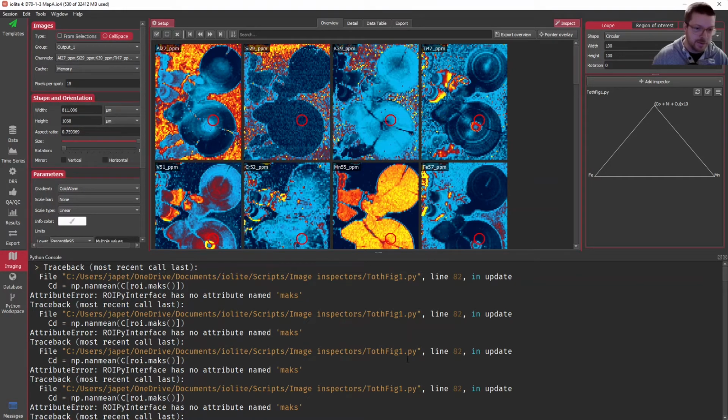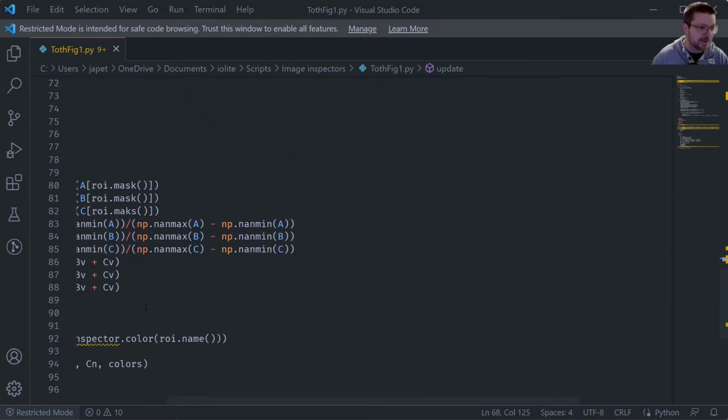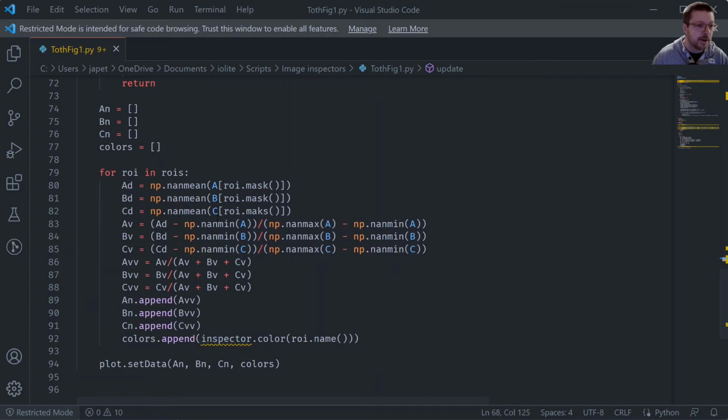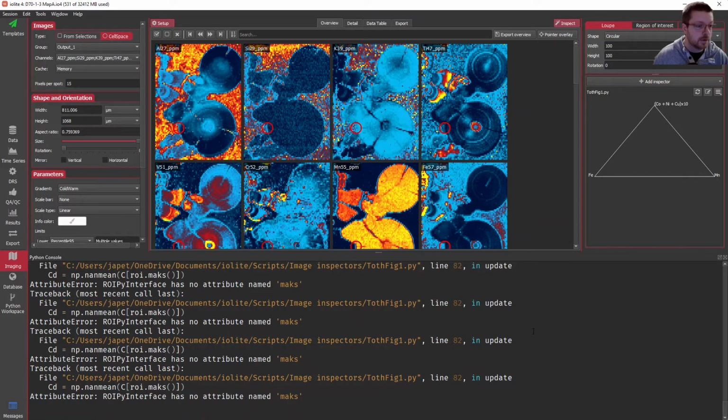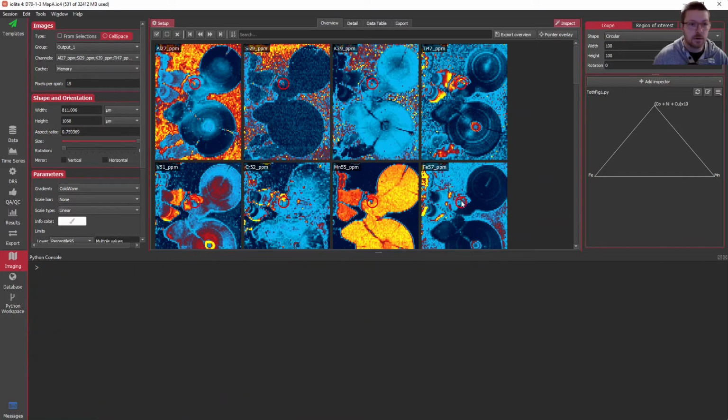Okay, another typo. So line 82. Let's go back. Line 82. I mistyped that. Okay. Holy moly. Let's clear that.